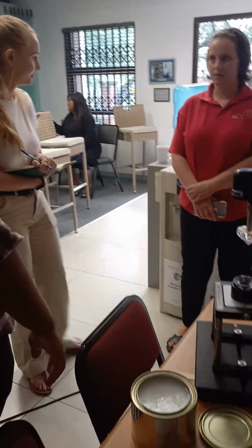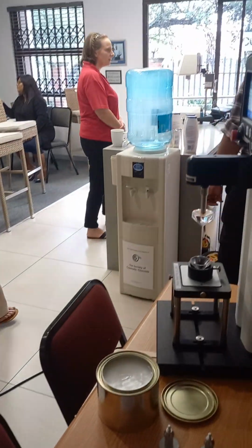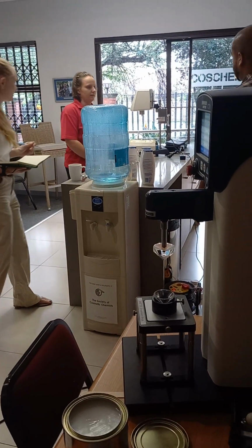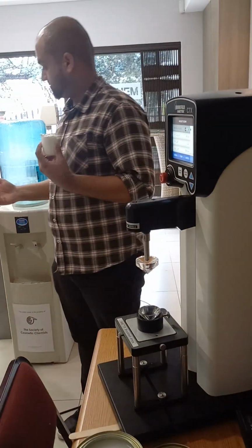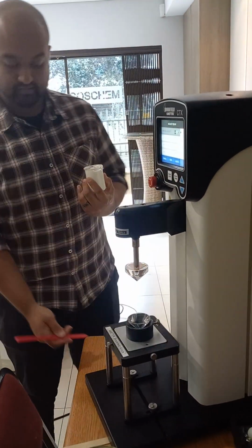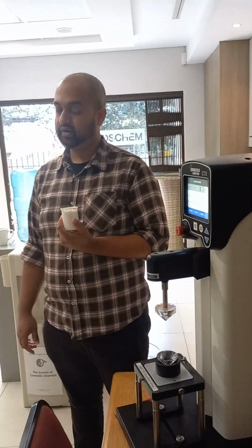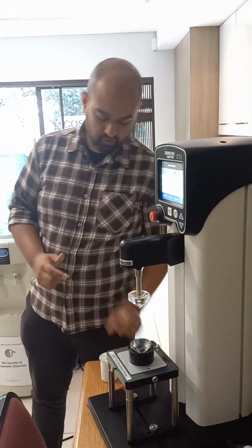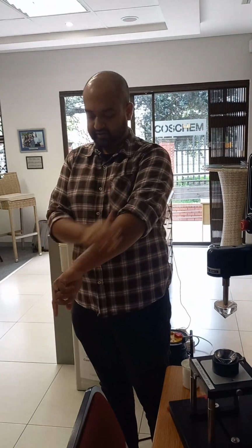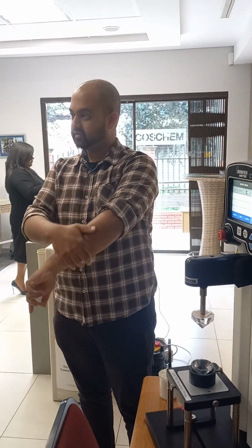Okay, so let's test the sunscreen. With sunscreen, this is pseudoplastic in nature, so it has a shear thinning behavior. When you apply it to your skin, the more you rub it in, the more it gets absorbed and the layer becomes thinner and the viscosity will change.